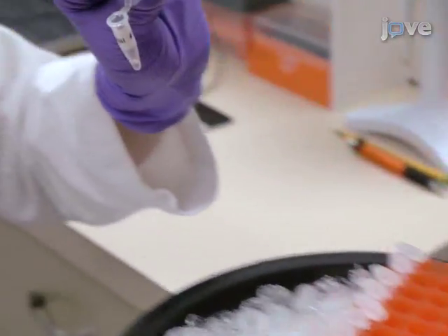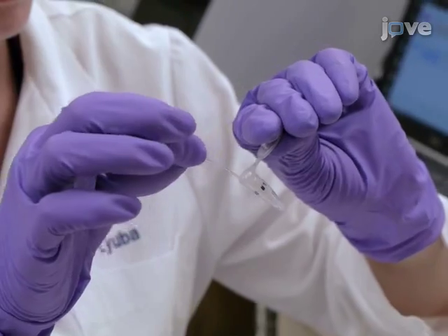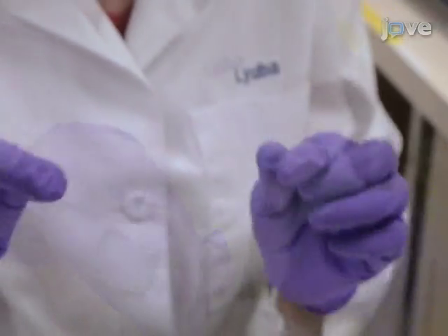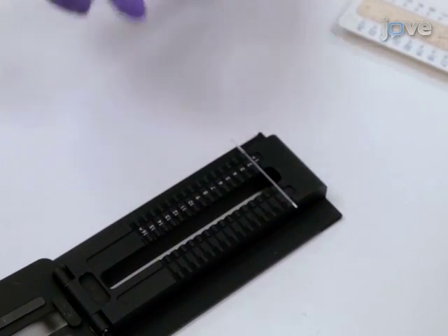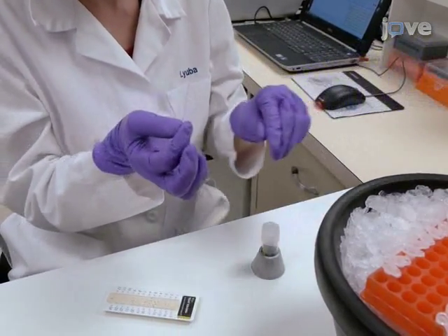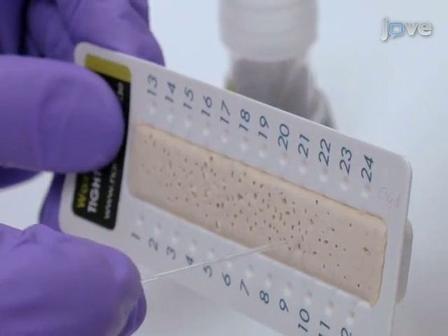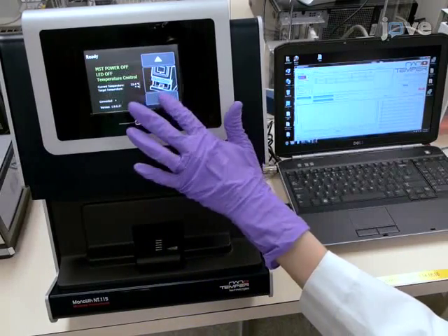Fill approximately 2/3 of the first capillary with the binding mixture from tube number 1, tilt it to move the solution towards the center, and place the capillary on the capillary tray to the position number 1. Repeat this step with the rest of the capillaries. Capillary ends can be plugged with wax for longer experiments. Place the tray inside the MST instrument and close the instrument's door.